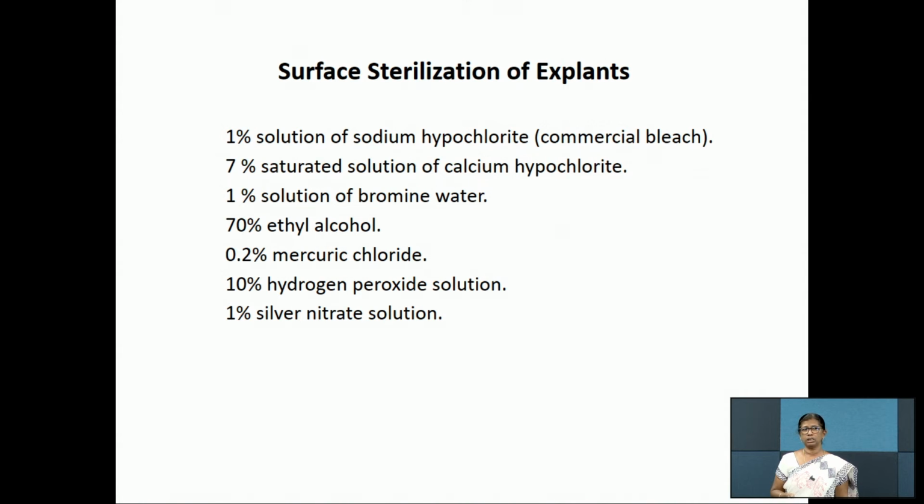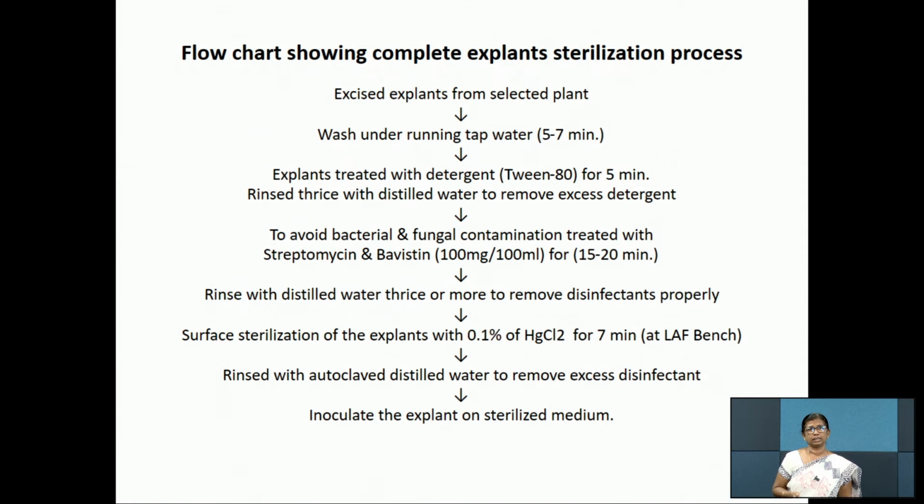It's not that all the sterilizing agents should be used. Any one or two can be used for surface sterilization of the explants. Overexposure to the sterilizing agents may also cause the death of the explants. So we should be very careful in standardizing the sterilization process.